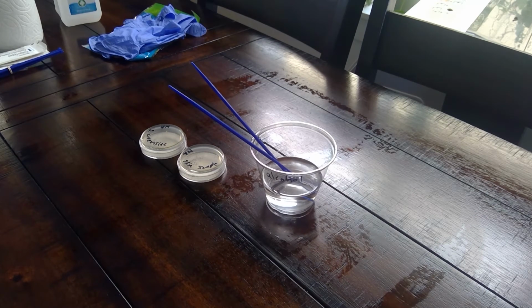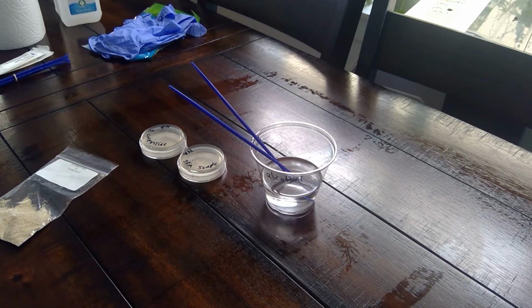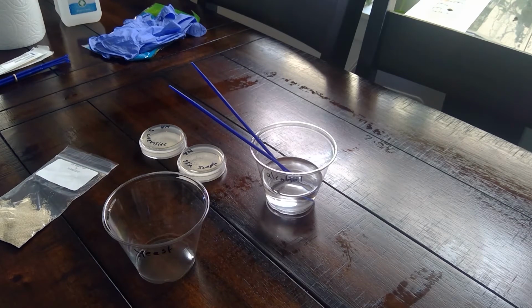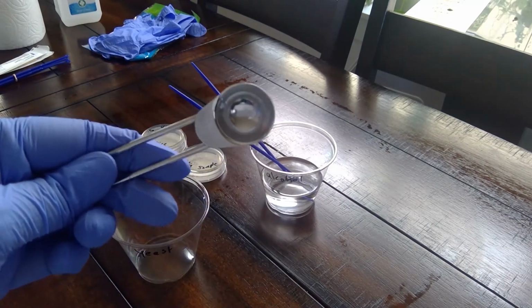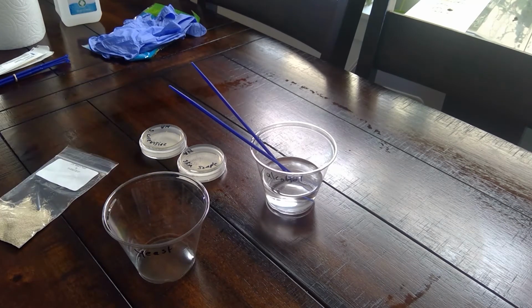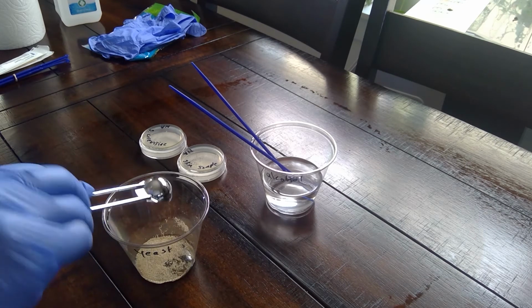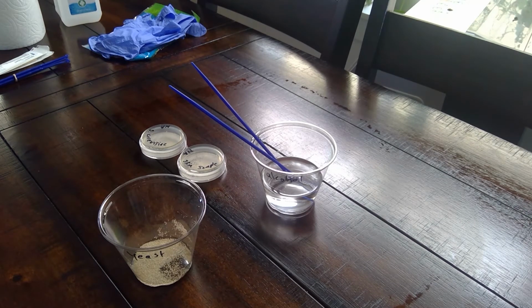And then step 8, open the yeast packet and carefully place approximately half a teaspoon of the powdered contents into an empty disposable cup and retain the remainder of the packet for future use. So this is going to be our yeast, which I probably don't need to label, but I'm just trying to be consistent. So you'll want to use a half teaspoon. We'll transfer that to our cup, and then we'll save the rest of our yeast for later.